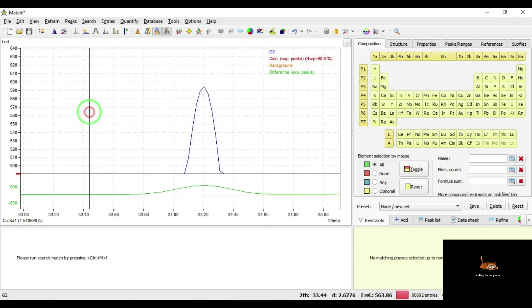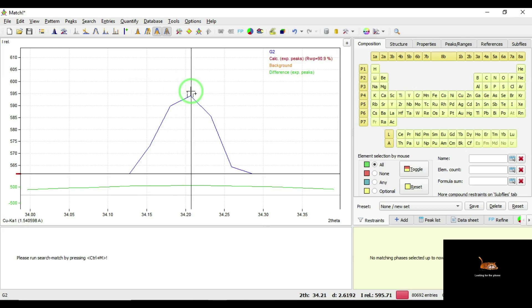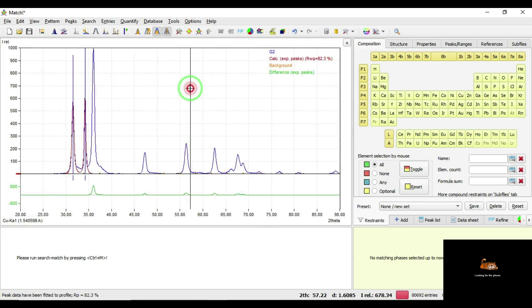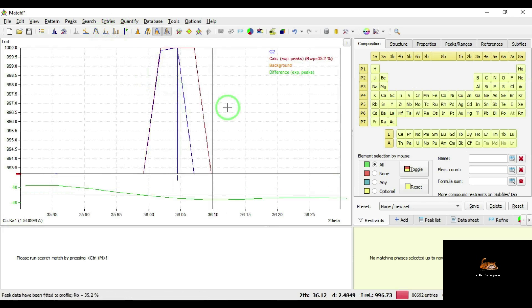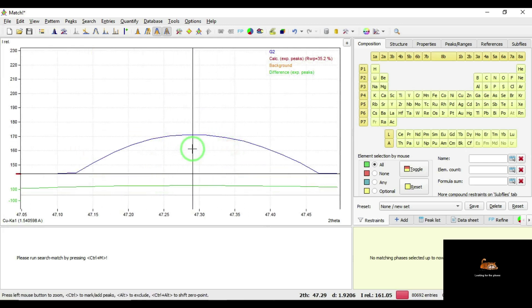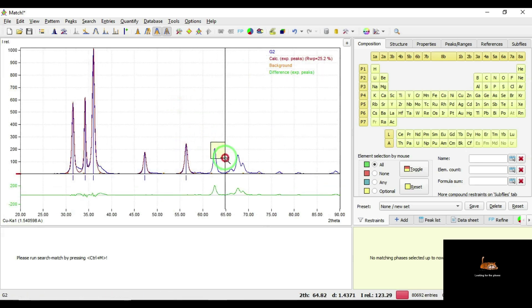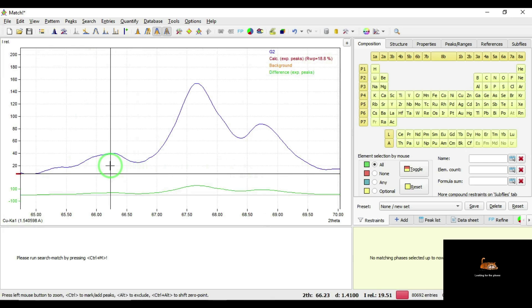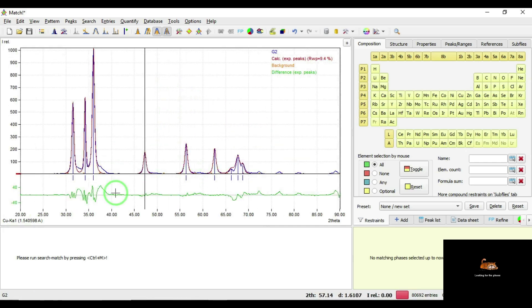Again I am going to select the next peak by dragging over it to zoom in. Again press Ctrl, place the vertical line at the maximum intensity position of the peak, then right-click the mouse. The peak will be selected. In this way you can select the remaining peaks. From 20 to 70 degrees 2-theta position, I have selected all the peaks.